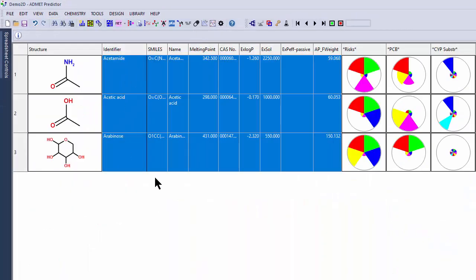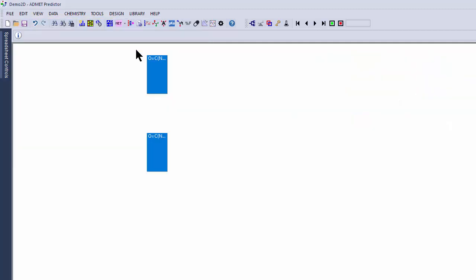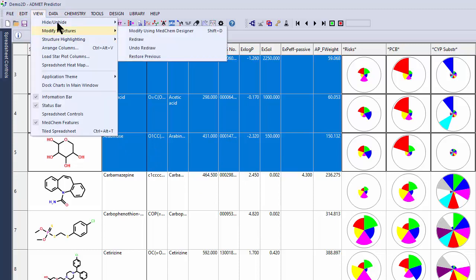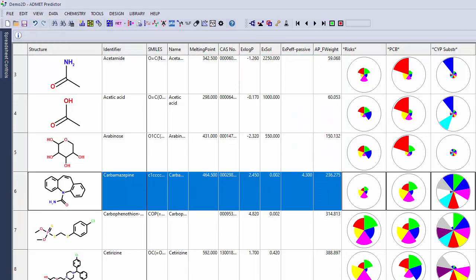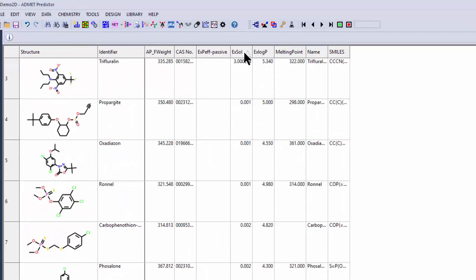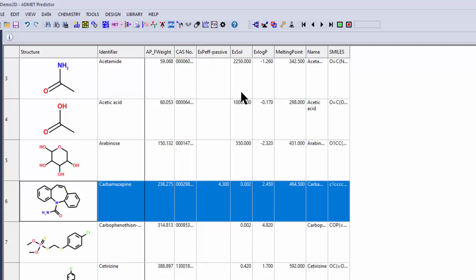One I use a lot: if I've selected rows, I'll use Control-Shift-H to hide everything except the rows I've selected. And now you see only the three rows that were selected. Once things are hidden, the Unhide All menu option becomes available and you can bring everything back into view. I also use Control-Alt-Hide to hide what's selected, and Control-Alt-U to unhide everything and bring it back into the main spreadsheet. We can also sort the spreadsheet based on any column in ascending or descending order. Let's go to our User Inputs to look at experimental solubility. If we click once on a column header, it sorts in ascending order; click another time, it sorts in descending order; click a third time, it unsorts the column.